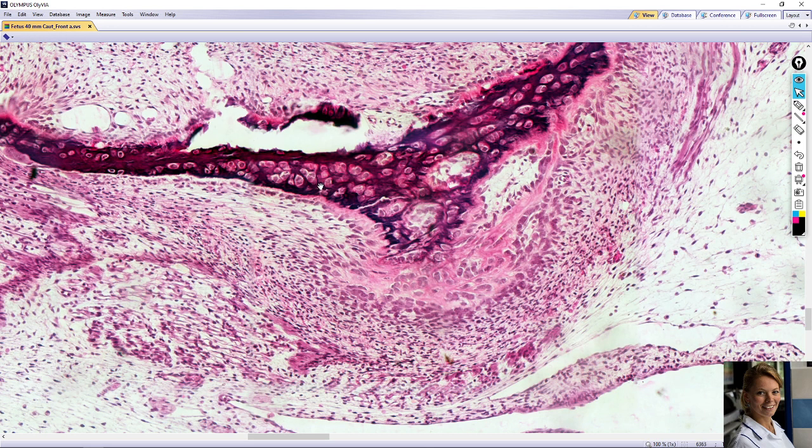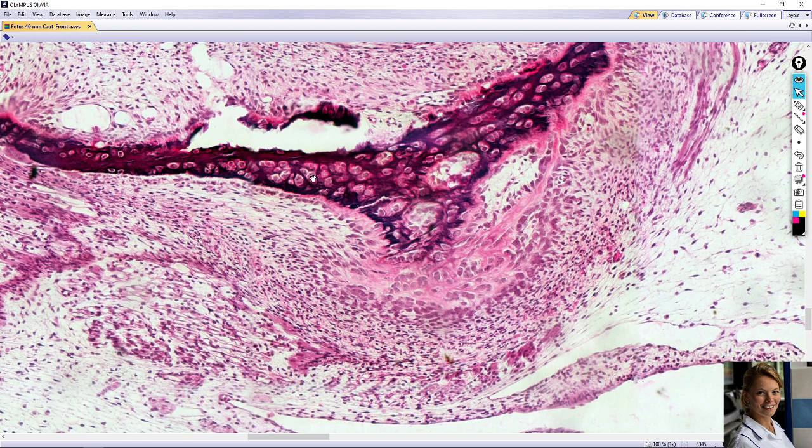In hematoxylin-eosin, the osteoid is rich pink. For example, here you can see osteoid beneath the osteoblasts. And also here it's osteoid, and here. Cuboidal cells or low columnar cells, these are osteoblasts, which produce osteoid.